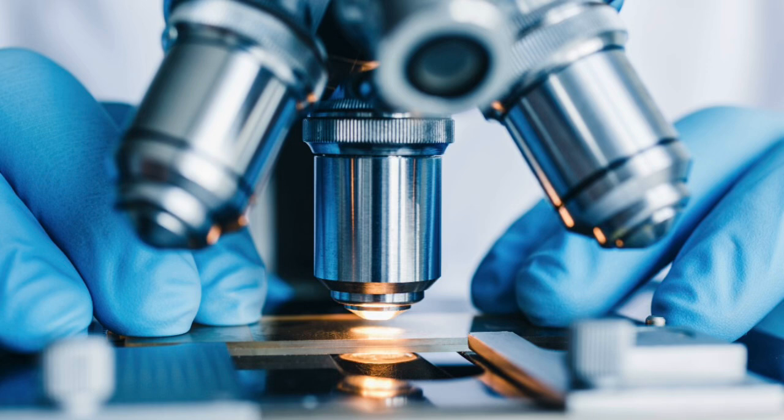A light source is another essential component. Proper lighting makes detail visible and enhances contrast in forensic examination. Lighting can be adjusted to highlight texture, edges, or surface patterns. This is especially important when examining fibers, hair, and tool marks.